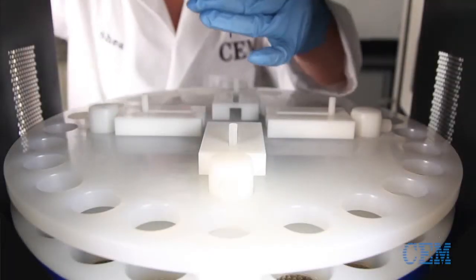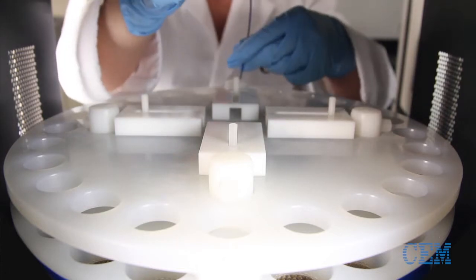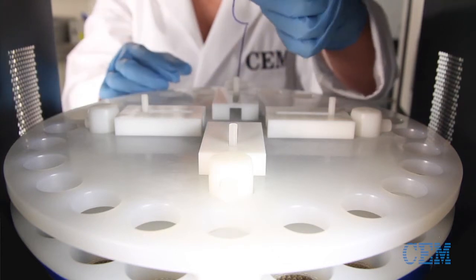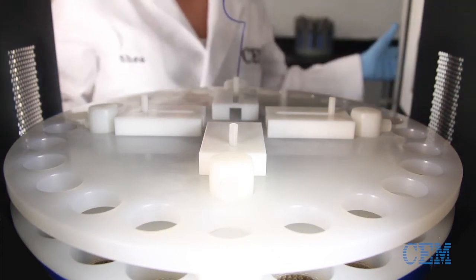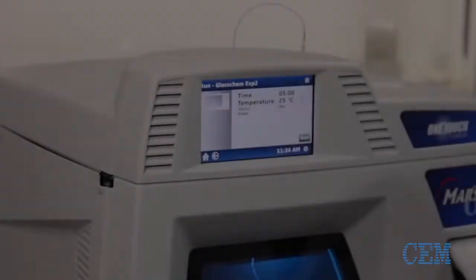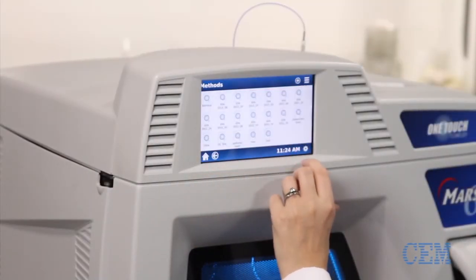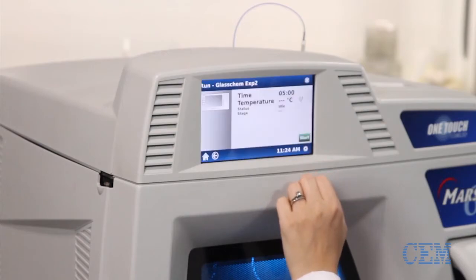Next, insert the fiber optic probe through the thermal well nut and into the thermal well, ensuring that the fiber optic probe is seated in the thermal well and then close the door. Select or program your desired method from the classic method menu and touch the play icon to begin the method.